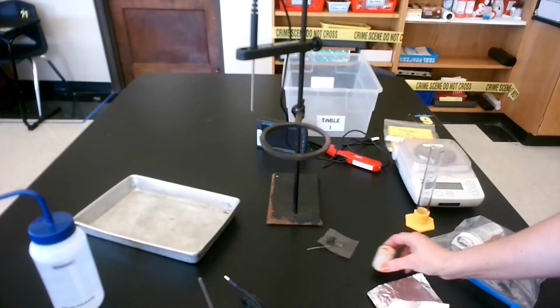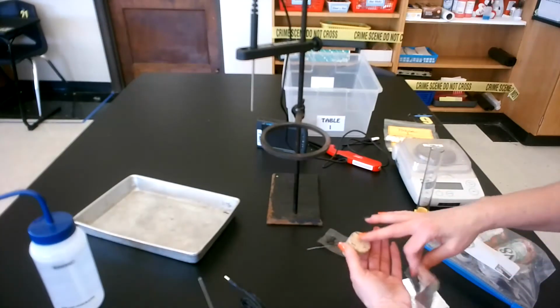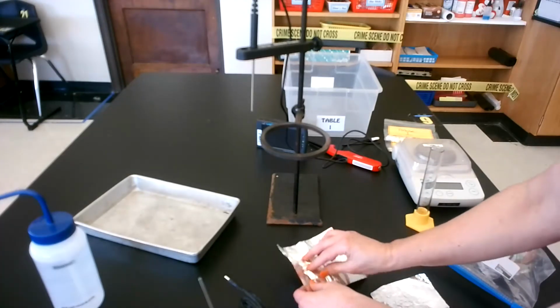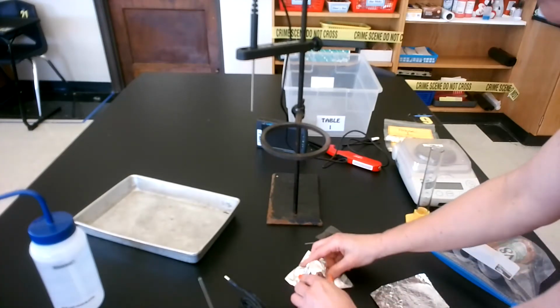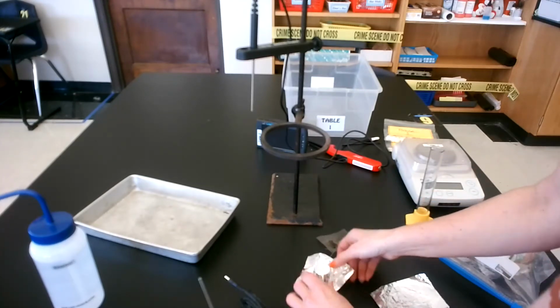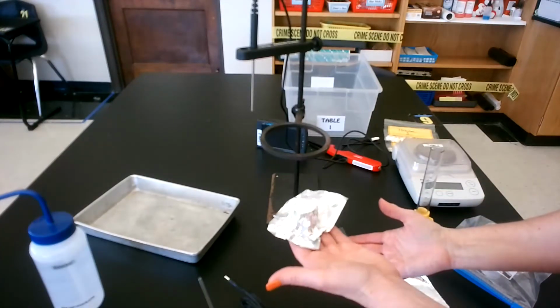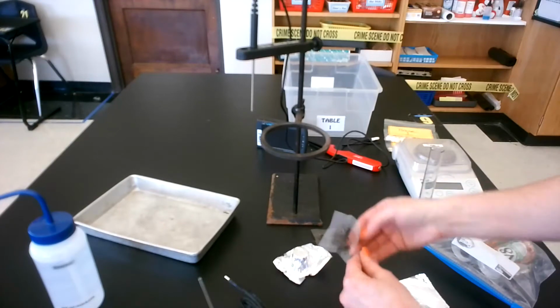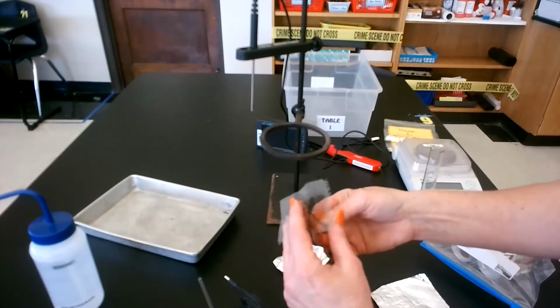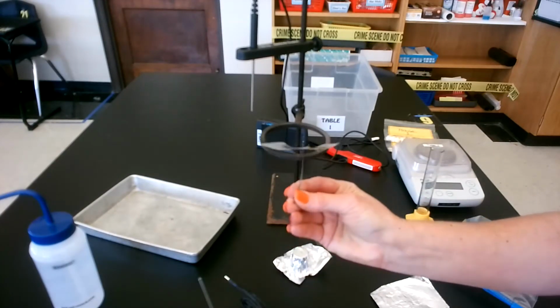So to build, we're going to take our cork, and you're going to notice how I have the wide base down, and then I'm going to put the foil over and then make a little ledge or a cup around it so that it looks like this. Okay? Then I'm going to take my screen and my paper clip, and I'm going to bend it so that it makes a little plate or a shelf.